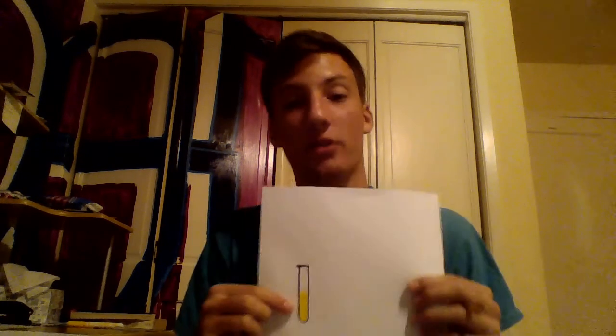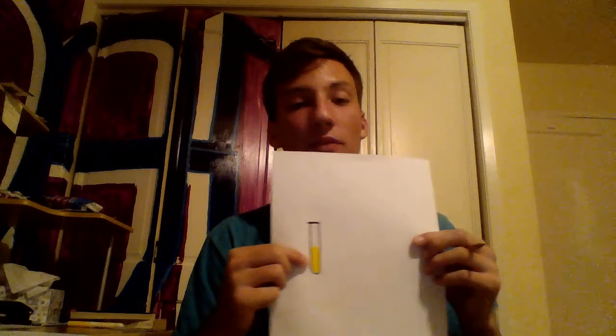We want to dilute. There we go, that's the word I was looking for. We want to dilute this sample of our DNA. So we're going to add some distilled water, and then we're going to add some primers, some enzymes. What that does is allow these enzymes to attach onto the vector backbone at specific points.